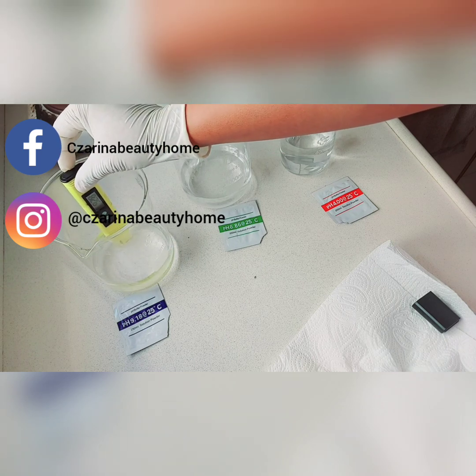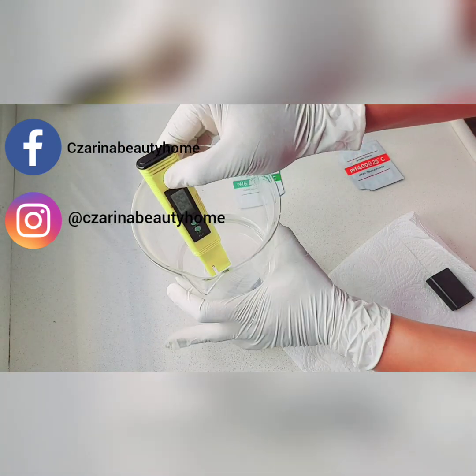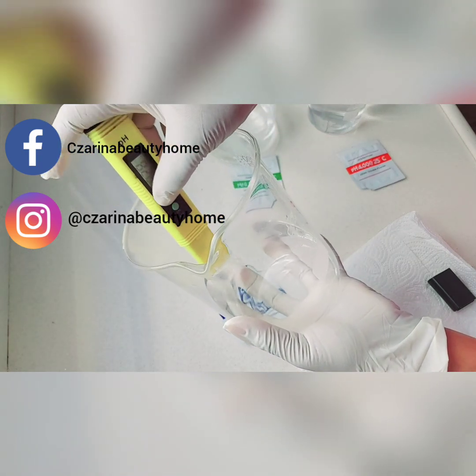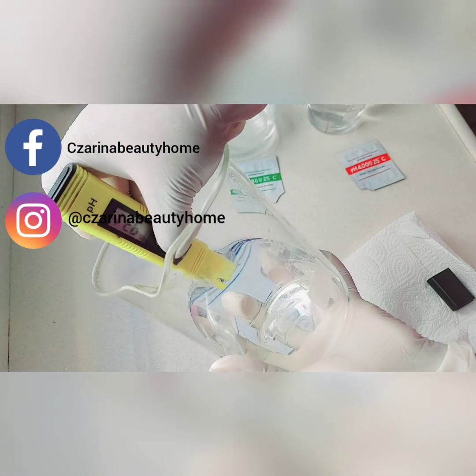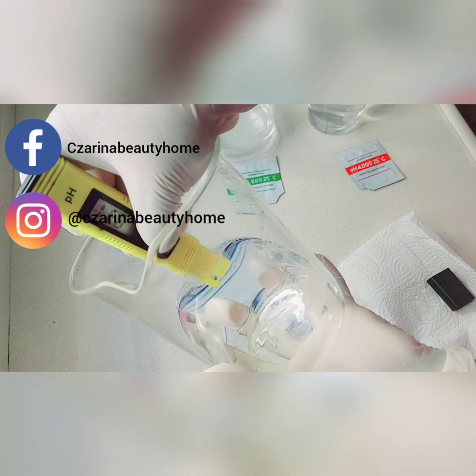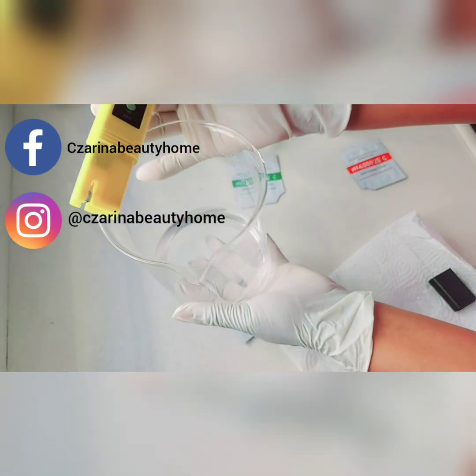Now for any reason, if you do the last one and it tells you 'error,' you have to start all over again. That means you didn't do the process properly, because if you don't do it properly the last solution will tell you 'error.' This applies to all pH calibration, regardless of the type of pH meter you buy. Once you get it right, you can see it reads 9.18, just as it came with the buffer powder.